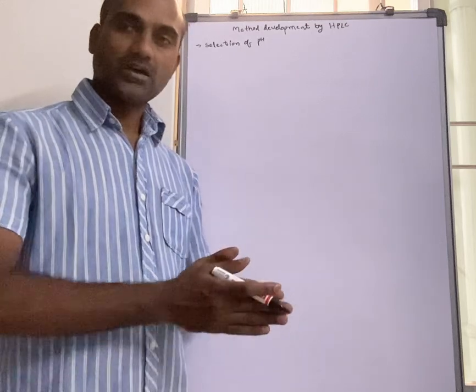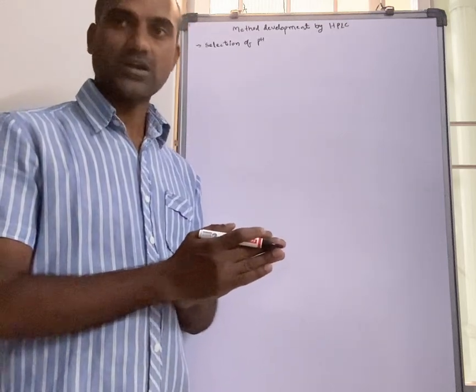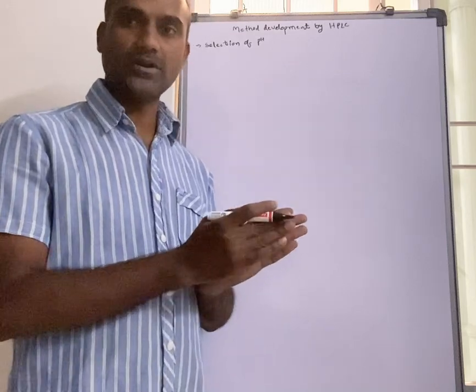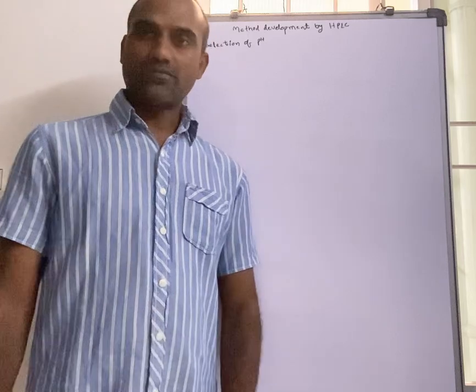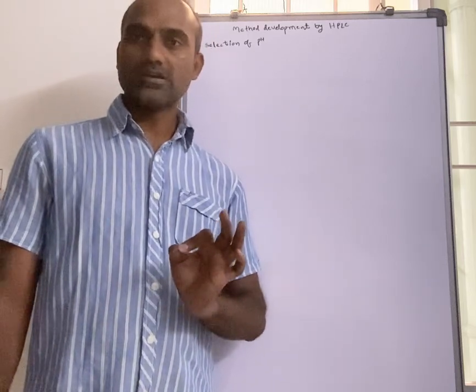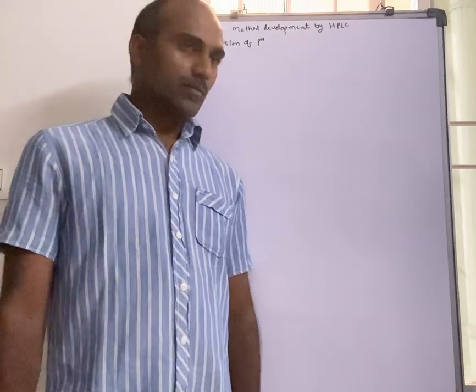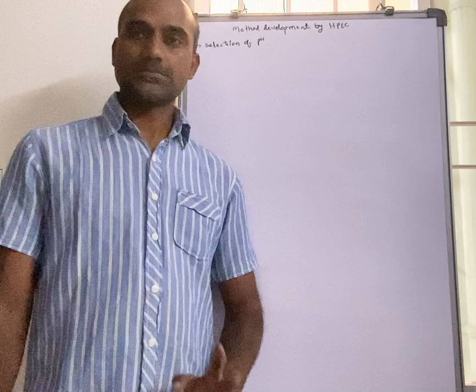Based on the retention, the separation of the impurities will take place, and we will get resolution between the impurities. So remember these 2 points: for acidic molecules use acidic mobile phase, and for basic molecules use basic mobile phase.